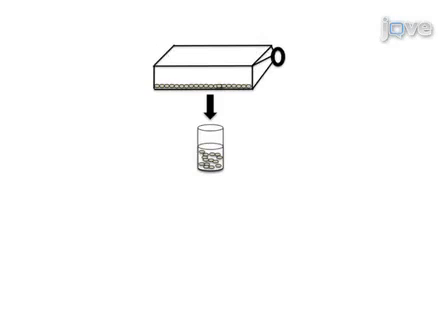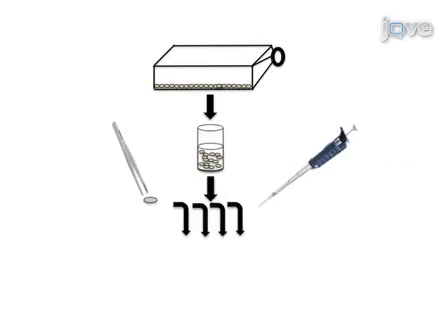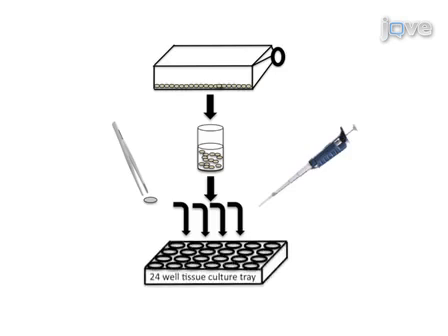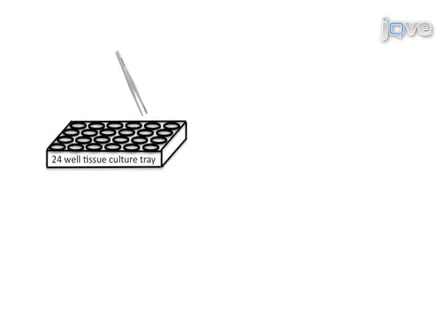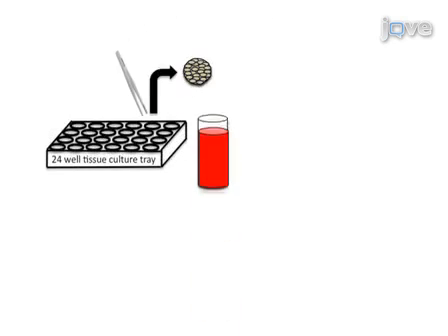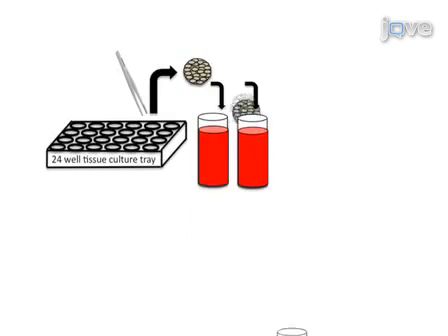Host cells in culture are transferred onto glass coverslips in a 24-well plate and incubated until they reach confluency. The coverslips are then washed and transferred to a new plate.